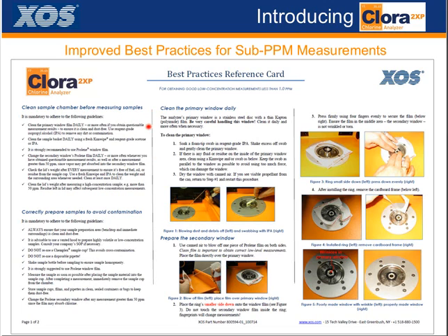So what we would ask you guys to do is to clean the sample chamber. On the XOS analyzer, the sample chamber is really just at the top. You can see here what we call the primary window. So there's really a small area where the sampling is actually done. So improving your maintenance of that area, between cleaning it with IPA, between using can duster to clean it up, and just making sure that you're consistent with it, it really can go a long way. And then the other thing we've done is we've improved the secondary window. So previously the design for our secondary window was up underneath the sample basket.